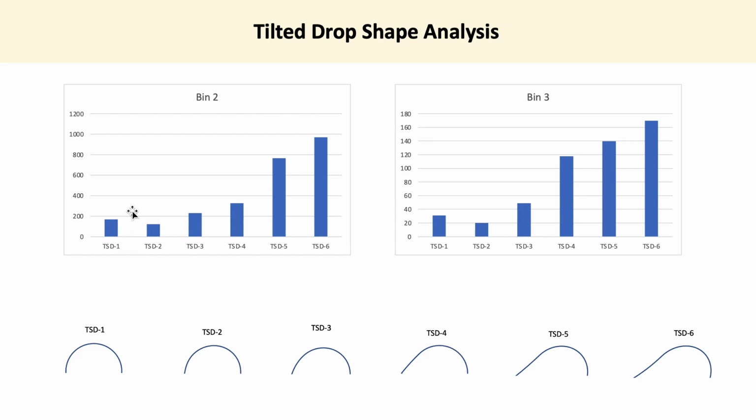That is, there might be something special about the initial phase of breaking equilibrium when a droplet encounters a vibration or a tilt. Whatever the case, this slide goes to show that the LCPC transform can detect very subtle changes in shape information in ways that are just beyond contact angles.